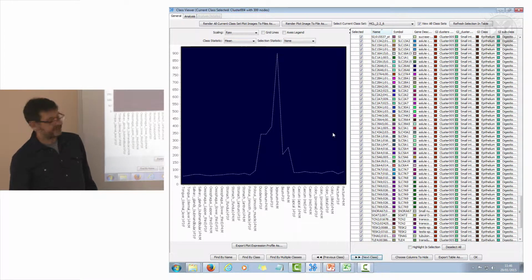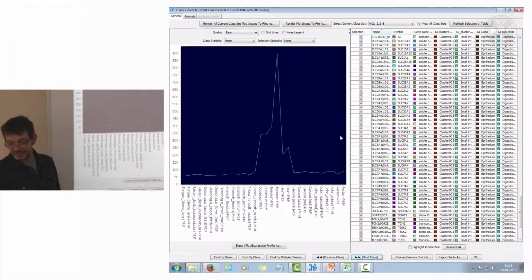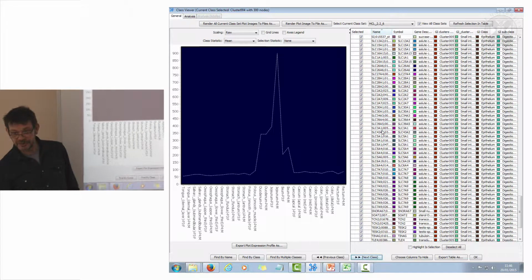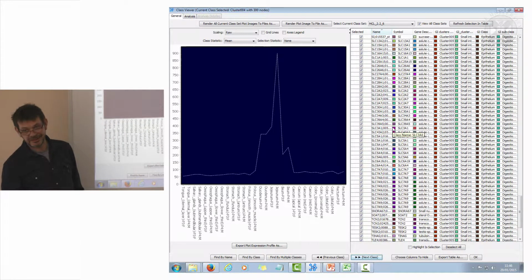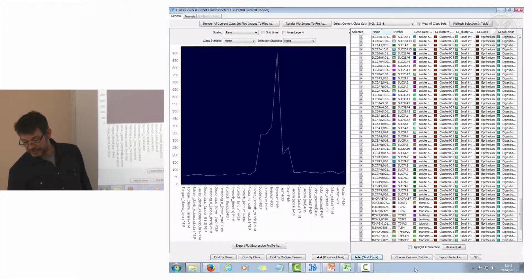So this bit only in the small intestine, okay? What's the small intestine got? Lots of, look at those, they're all your transporters. So all these are epithelial transporters that take your food and basically internalize it. And likewise you can go through here.